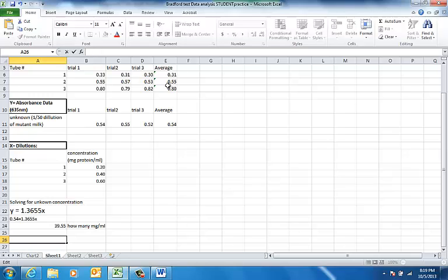And so that is all I'm going to go over right now with you for some fundamentals of how you can use Excel to analyze data and graph data.